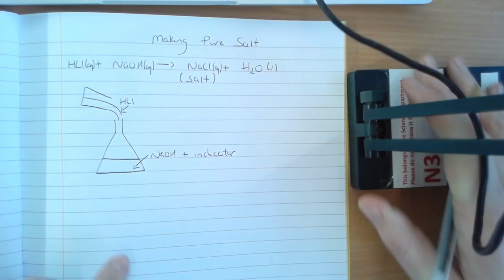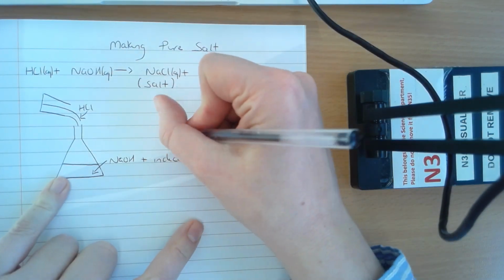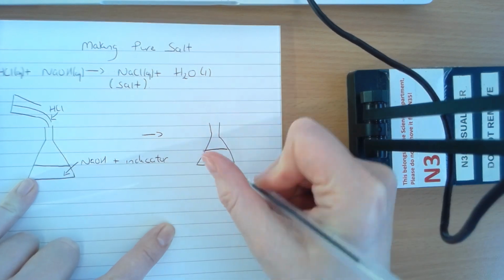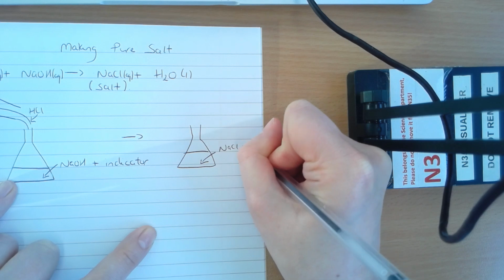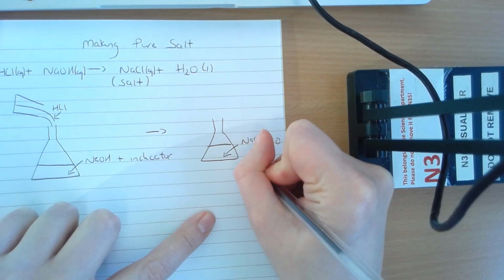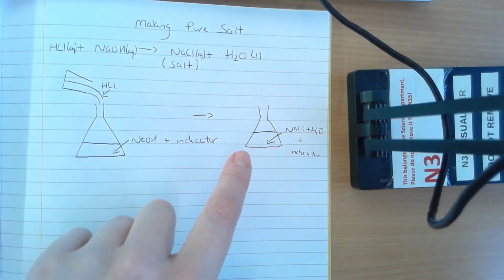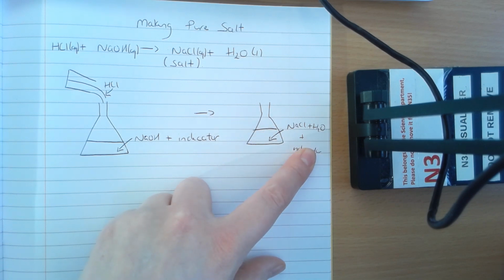The other thing is, after you do this particular reaction in my conical flask, even if I did have excellent control and I managed to add exactly the right quantity of HCl to properly neutralize the NaOH, I'm going to have salt, water, and I'm still going to have that indicator in there. You will still have indicator left in the flask, and that means that you're going to have to repeat the experiment again without the indicator.